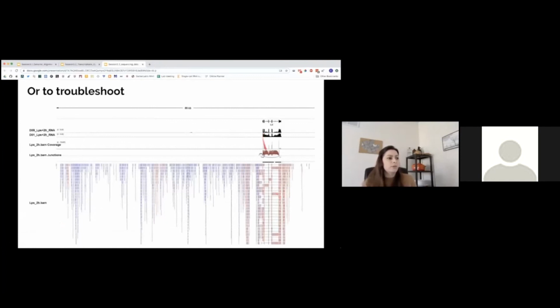For example, you can create this junction track, and you can see if most of the reads coming from other areas, not the transcript, are on a different strand and can be coming from enhancer transcription. And you can check for the splicing and see if you see all of those splicing junctions you expect, given the isoform you know is there.